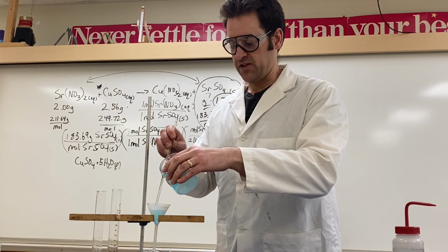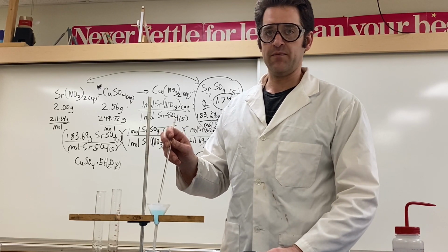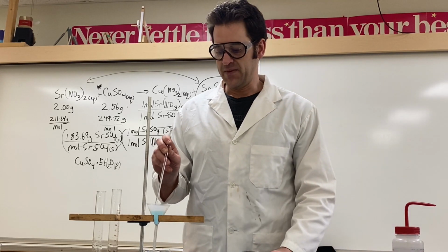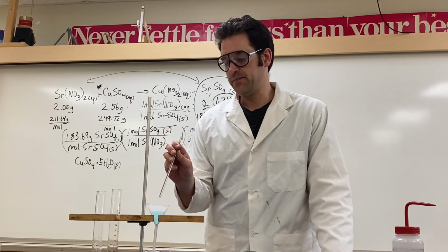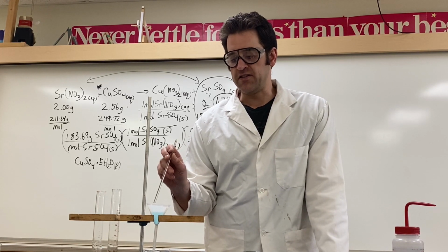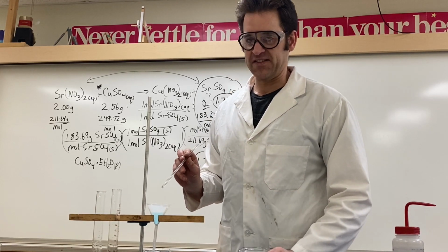Now you can live dangerously and do this a lot higher, but I'm not great at this technique, so I stay kind of low. I don't know, what do you do, Z-dawg, there? Just like that. Yeah, you don't try and go from the side and use the hydrophilic forces to cling to the glass? I've seen people do that. Yeah, that can be done. Yeah, that's fancy. Main thing is not to overflow our funnel here so that we lose precipitate again. Right. If you go above the paper, then it's just going to go down the other side of it and you're going to lose it. I've done that before. Not paying attention, you overfill it and you feel like a silly person.